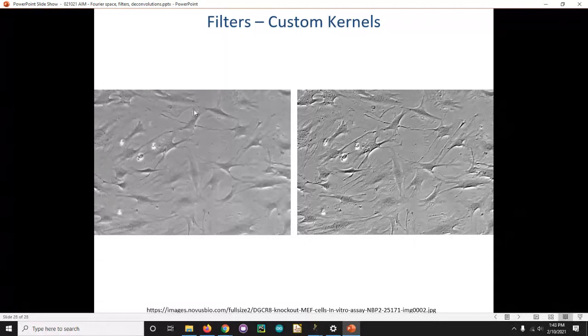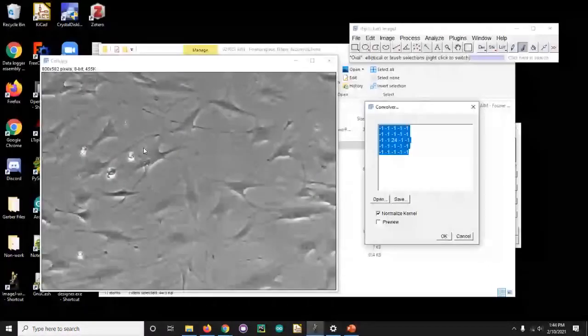To emboss, really all you're doing is taking the derivative of the image, which is exactly what DIC is doing. So sharp rising edges in intensity are encoded one way, and sharp dropping edges are encoded another. You can say rising intensity is bright, dropping is dark. So do that.